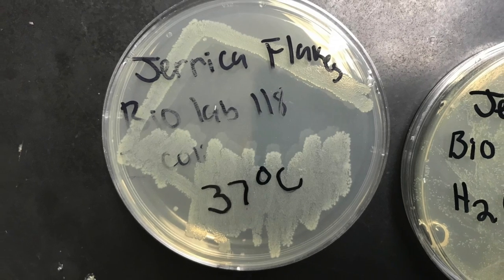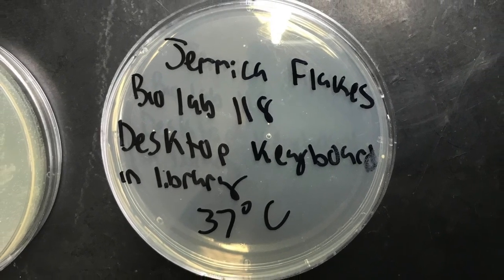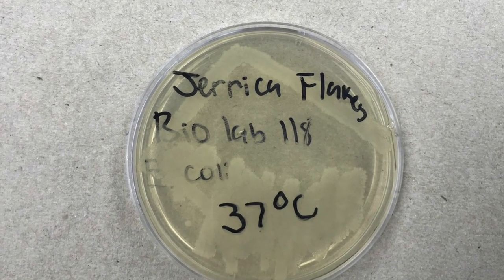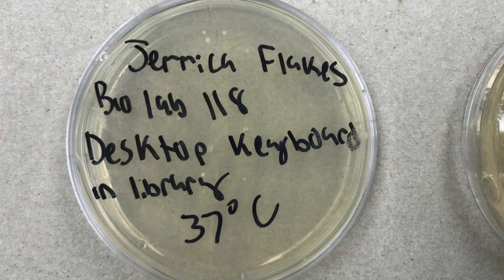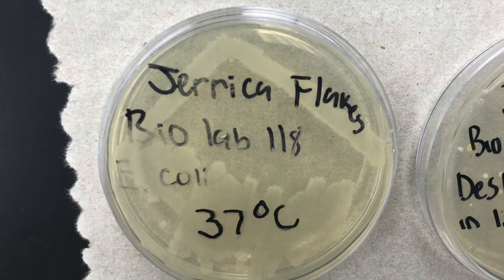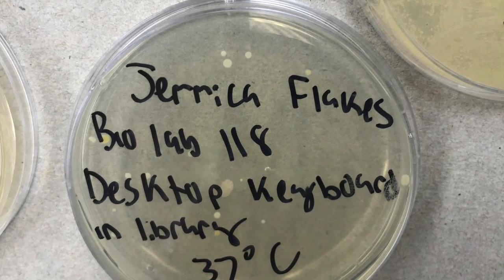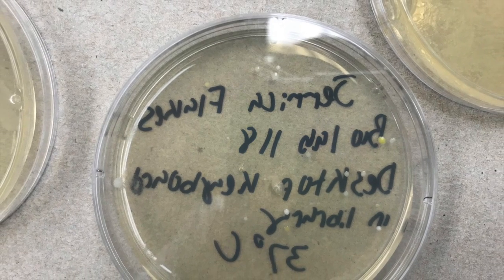As you can tell, E. coli had the most growth after a day, and the desktop didn't really have much yet. But by day 2, E. coli has spread even more, and you start seeing little white dots on the desktop. On day 3, the E. coli swab lines started to spread out in width. And then on the desktop swab, more bacterial cultures appeared, and some were different colors.